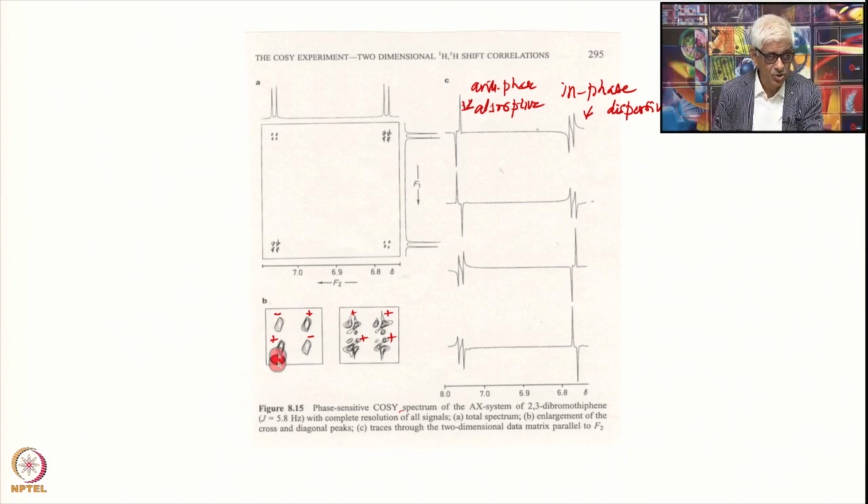Here I have clear resolution along this axis, the peaks are well separated, therefore I do not have any cancellations. But suppose this resolution is not sufficient, then there is a possibility of cancellation of these intensities. The sum of this portion may cancel with some of these intensities.